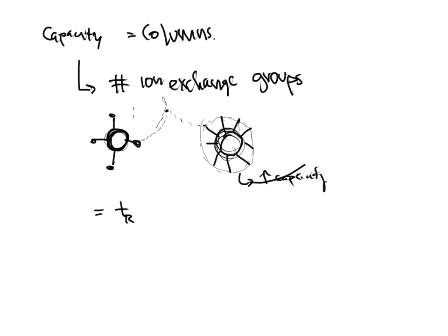So it's not going to get held behind. And it just kind of zooms off and it moves off to the next particle that might be down here toward the bottom. So they're going to move through the column a little bit faster if the capacity is very low. All right? So retention time is affected by capacity, because if they run out of spaces to stay in, they have to just keep driving along the interstate until they find a vacancy at a hotel that they can pull off and stay in, right?